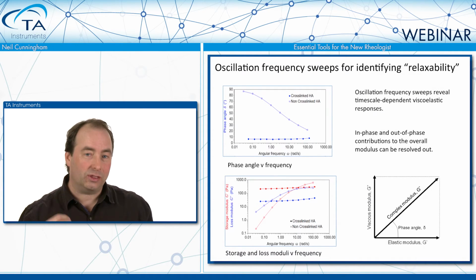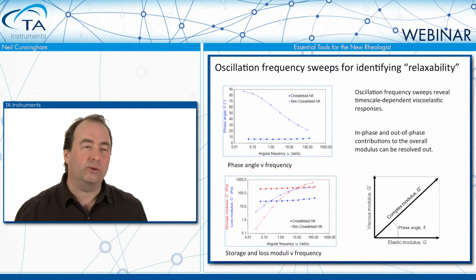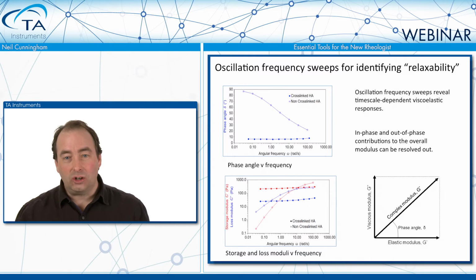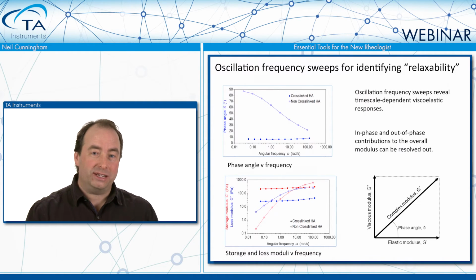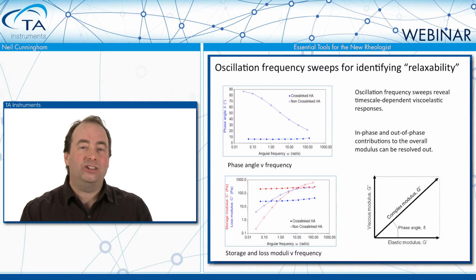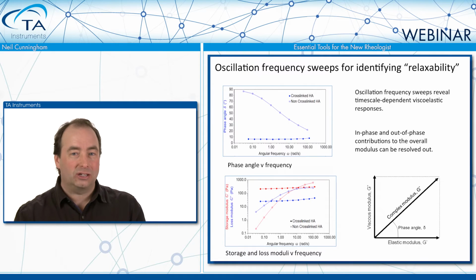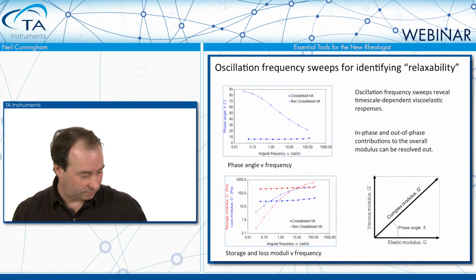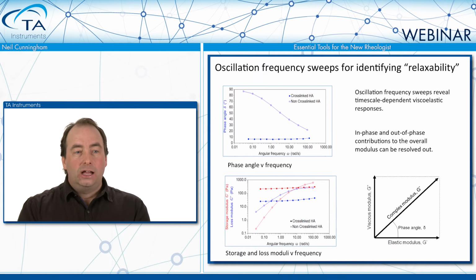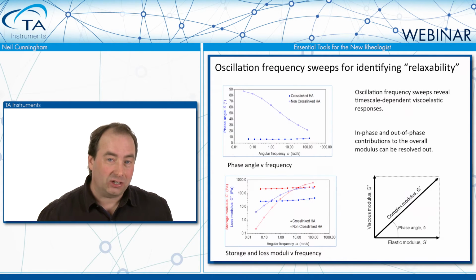So the liquid relaxes, or the material relaxes into a liquid-like behavior. You can often see this with shower gel, actually. When you squirt a dollop of shower gel into your hand, the moment it hits your hand, you can see that elastic response. You can see that sort of elastic bounce, and very quickly it then relaxes into this liquid-like behavior.